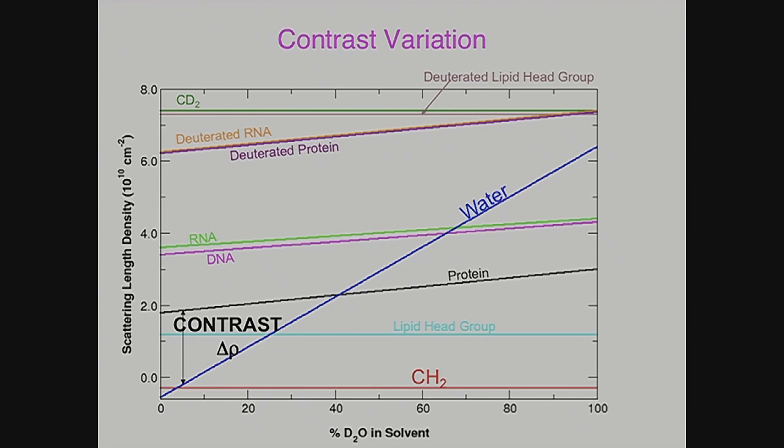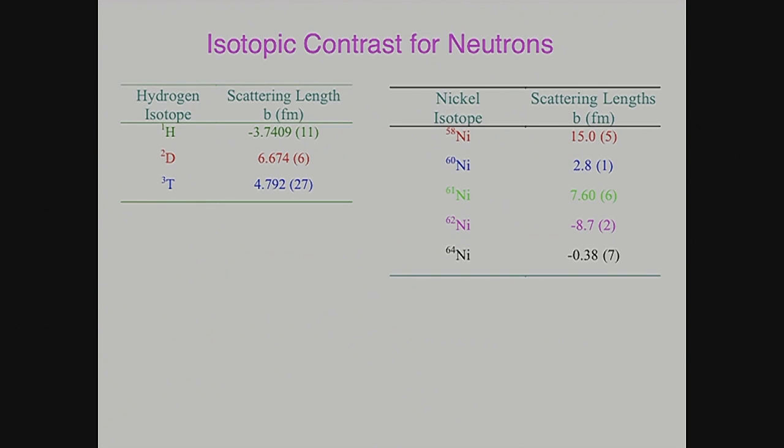The contrast is great, but you have to think about what the thermodynamics is as well sometimes. But anyway, it's a technique that is widely used in small angle scattering and has been very successful in chemistry, polymer chemistry in particular, and in biology.